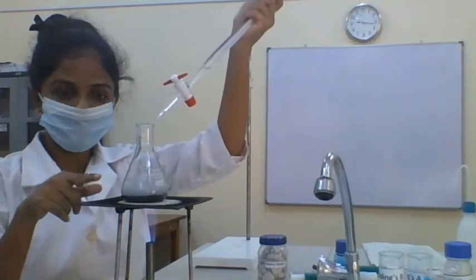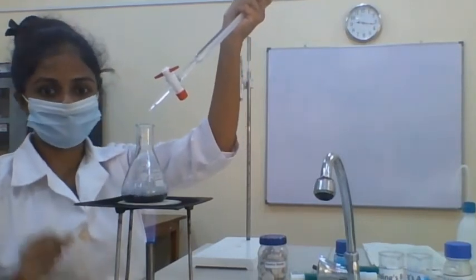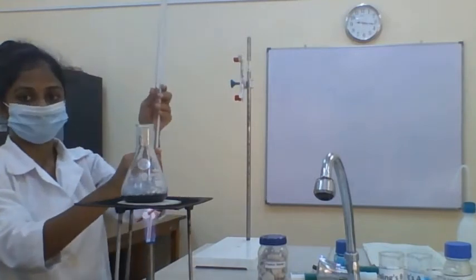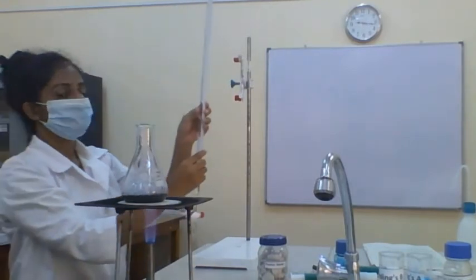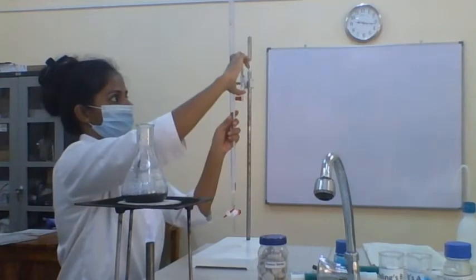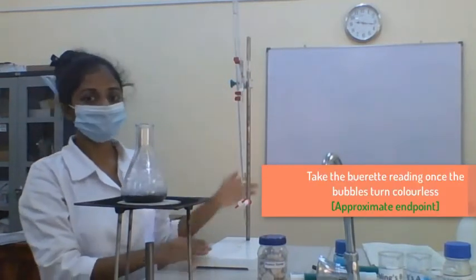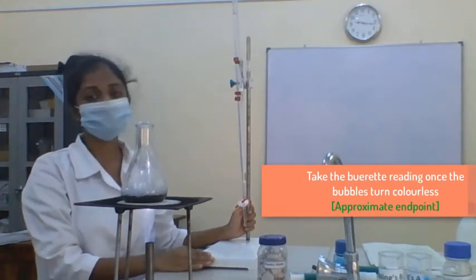Here you may see the bubbles become colorless. Then you have to take the readings and it will be the approximate endpoint.